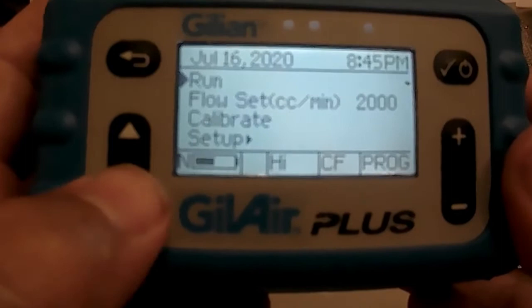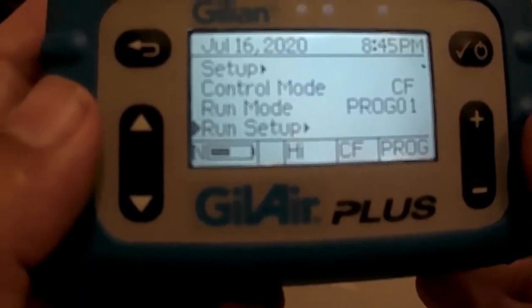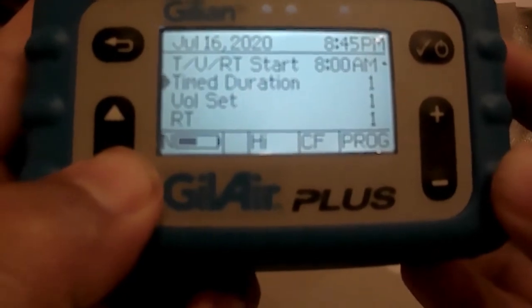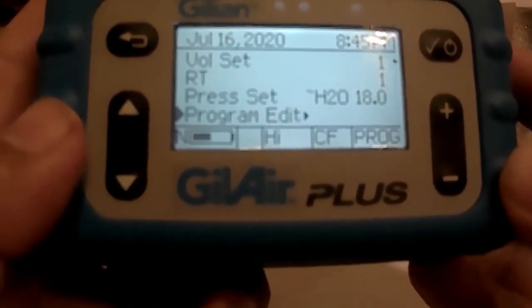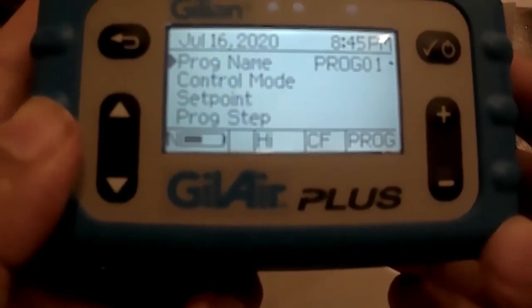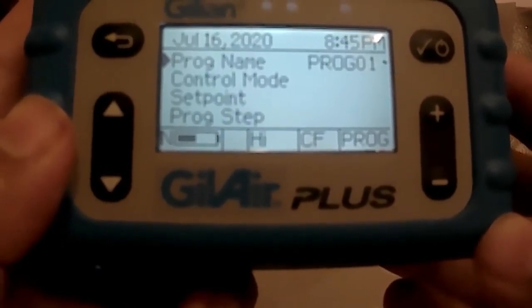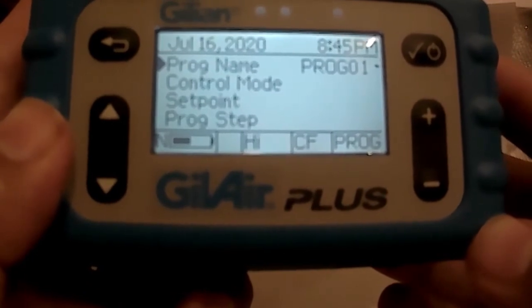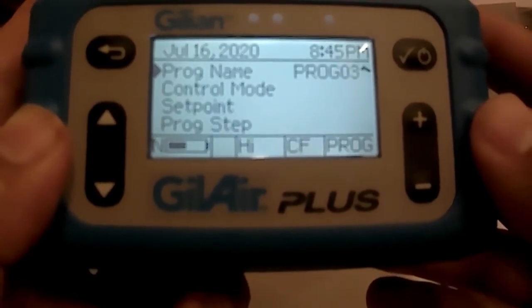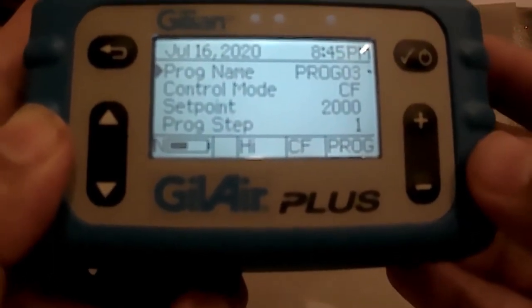To begin, from the main menu you will arrow down to the run setup function and select enter to go into the sub menu. From the sub menu you will continue to arrow down to the function that says program edit and hit enter. We will now select which program we want. I've already established program one, so we're going to go to the next program — in this case program number three — and hit enter to set up that program.